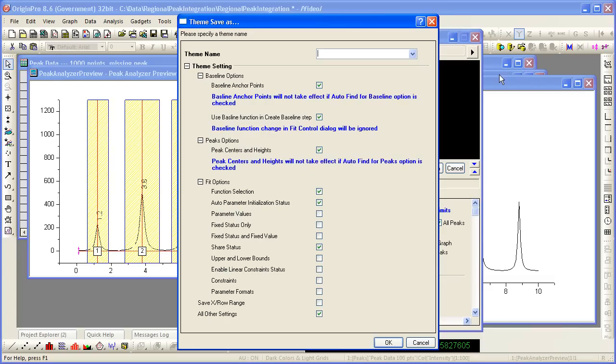I want to save this theme, this set of options for PA so that I can use it on subsequent datasets. So I will call this PAX region.